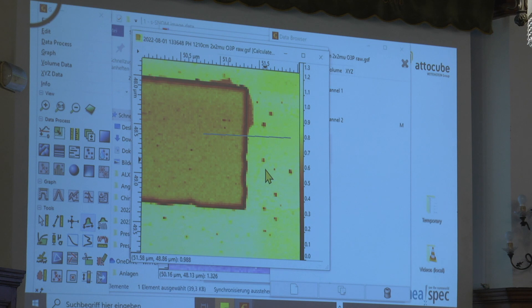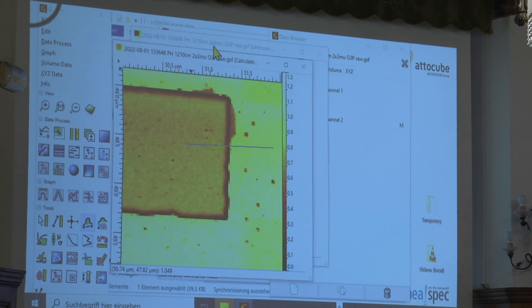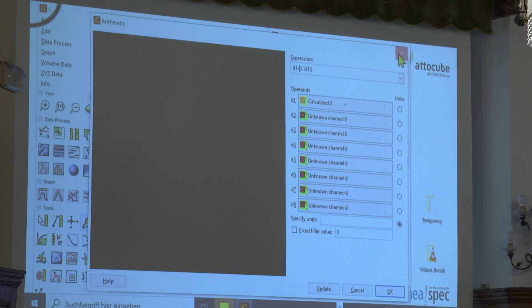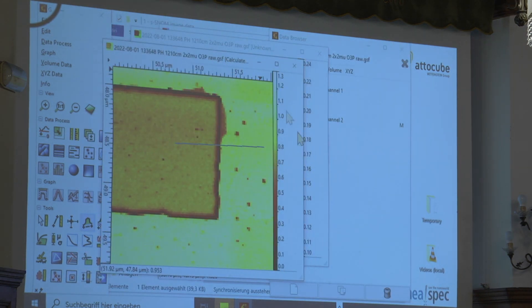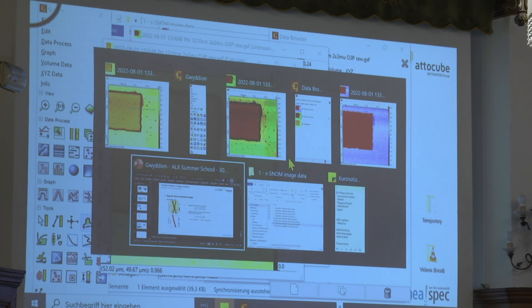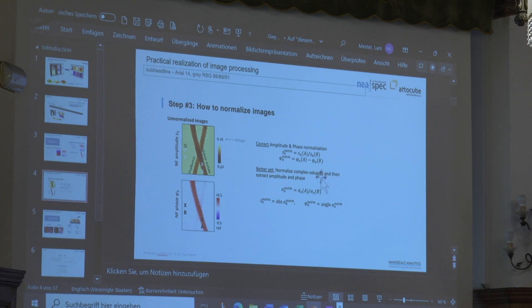We can do the same with the phase. Instead of dividing by the reference value, you subtract the reference value. So this is normalized, has a physical meaning, and we managed to circumvent the complex number problem.